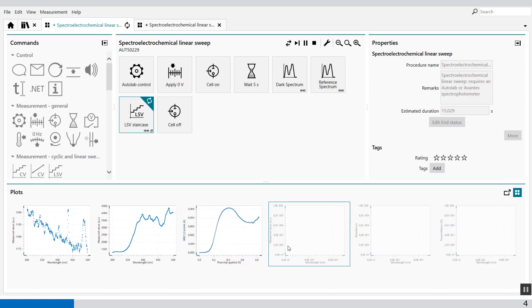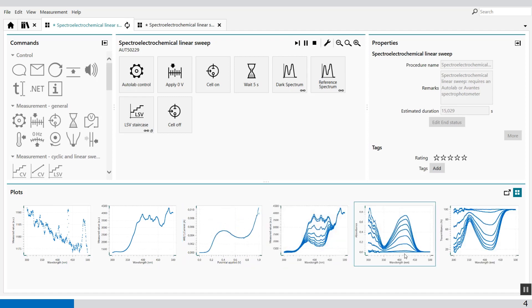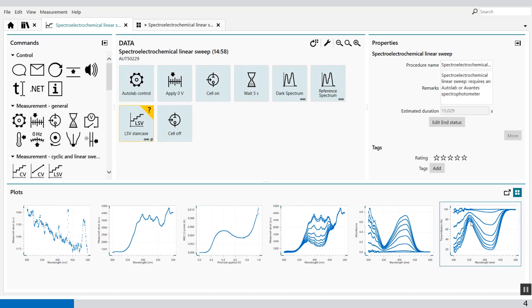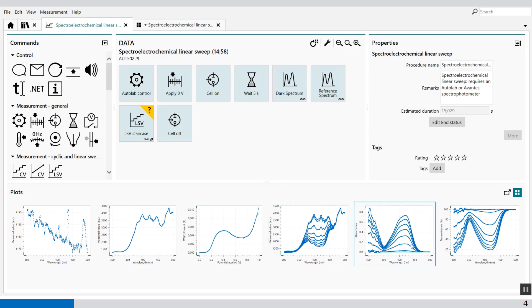And if the LSV is finished, you'll see the raw file, the absorbance, and the transmittance. So you already have the value available.